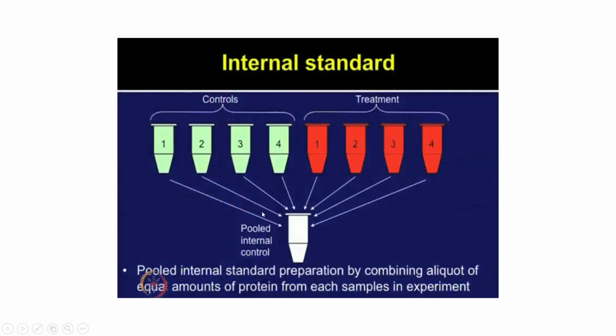So that's basically how the internal standard helps you dismiss the unwanted peaks or unwanted peptides you might end up getting in your samples or in your control, which are not present in your pooled sample, quality control or internal standard sample. This will act as a control and give you a comparison if there is any contamination happening afterwards while preparing the sample, etc. So that can be neglected, and if they are visible in your spectra, those can be cancelled out.